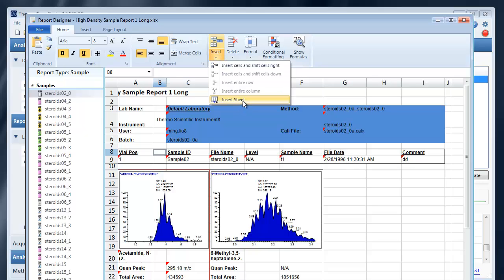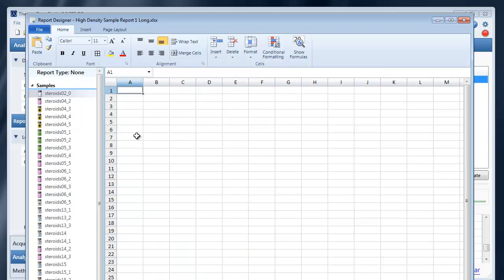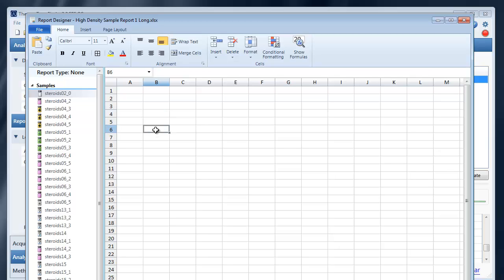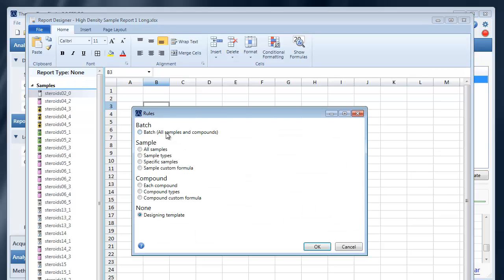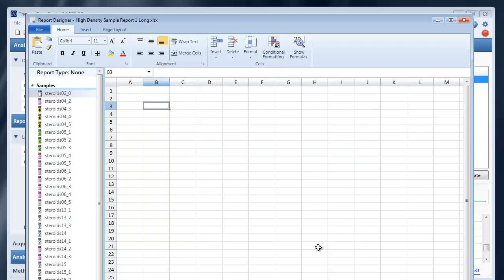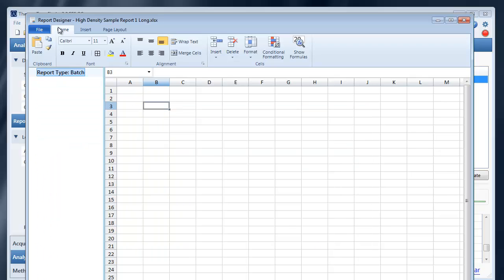I can also insert a sheet and begin designing the second sheet of this template. I could make this a batch report for example. And we'll get into inserting content in the next tutorial.